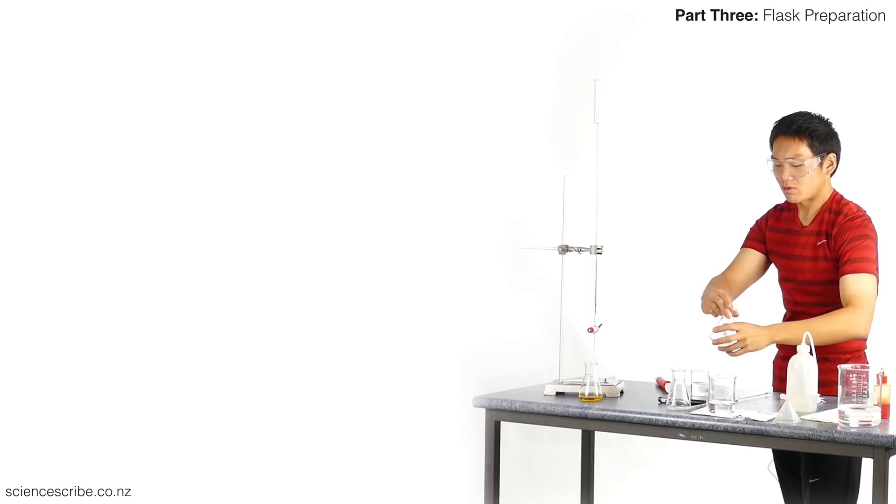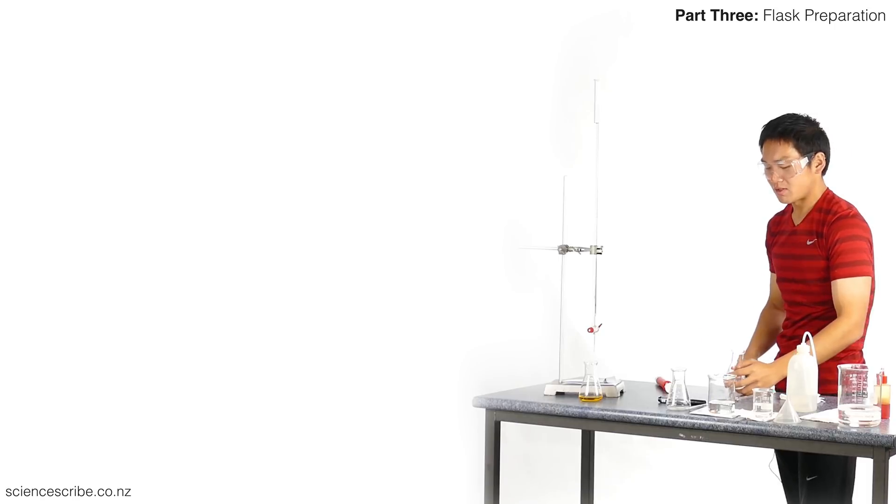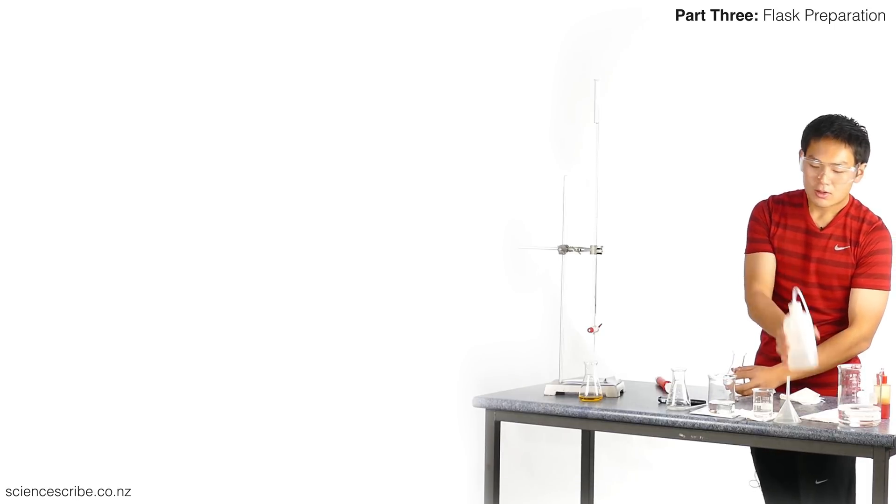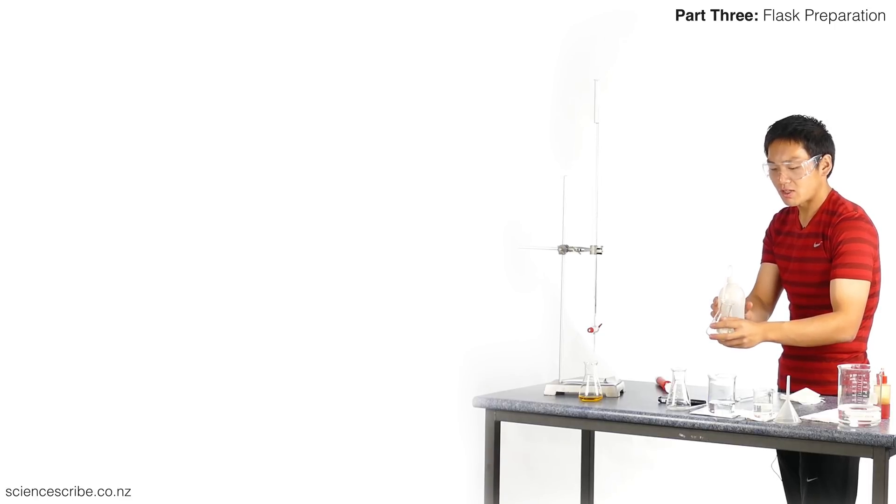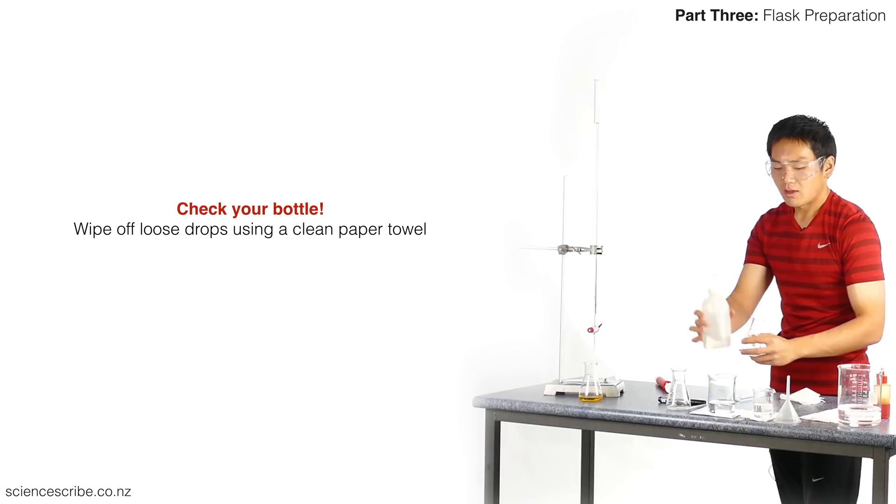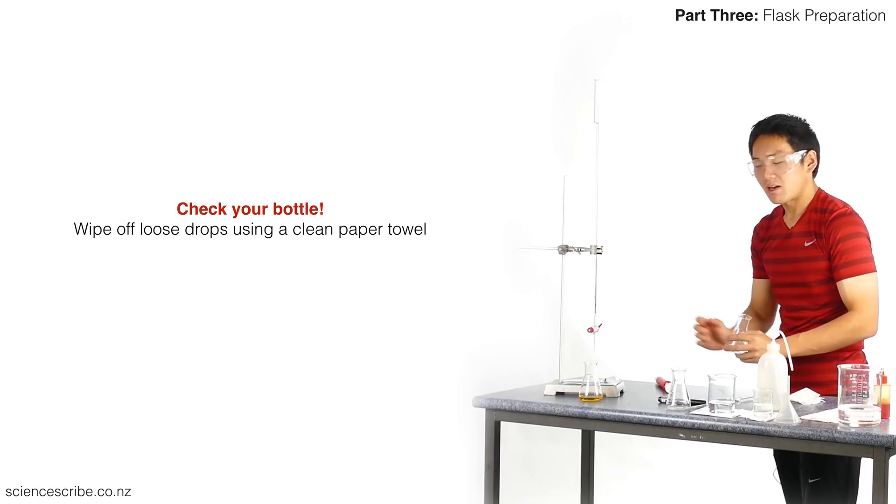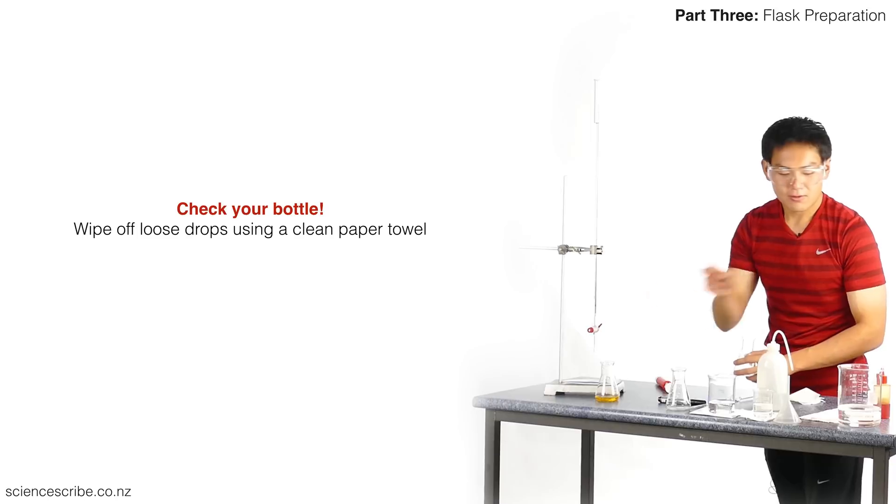There is always going to be a drop left over at the end of the pipette. Tap three times: one, two, and three. Place your pipette down carefully between two pieces of equipment or two bottles. Move your stuff off to the side so that you don't get any risk of contamination. We also remember that we had some chemical left over on that inner wall from the pipette, so we're going to wash that down with our wash bottle. We're then going to add one drop of indicator because, like last time, one drop of indicator was actually enough for us.